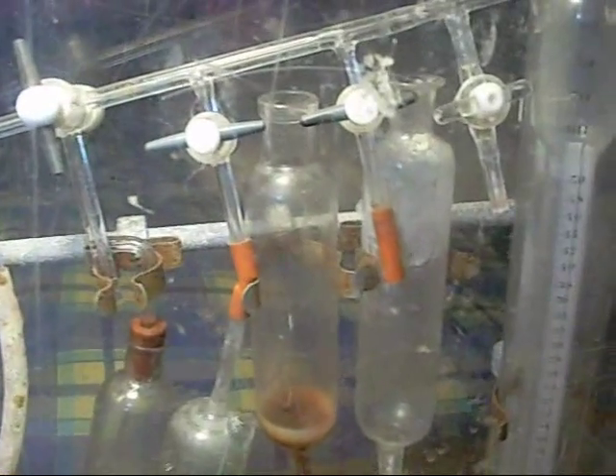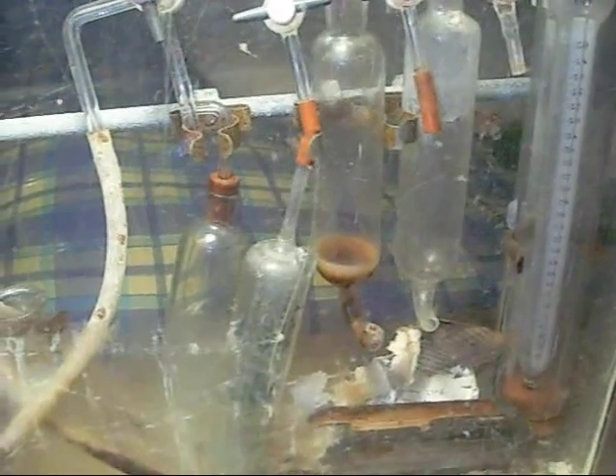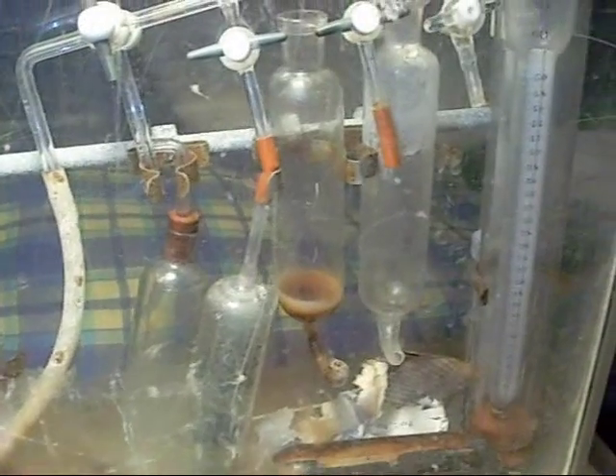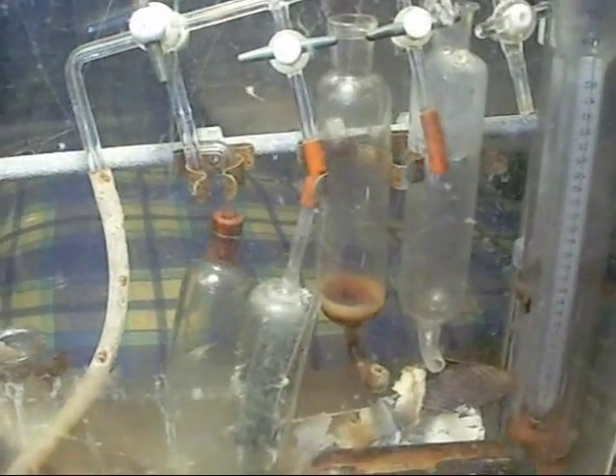Hopefully I can make this up to something with my vacuum pump that I'm playing with at the moment. Any ideas on how this thing works or info, please pass it on. Thanks.